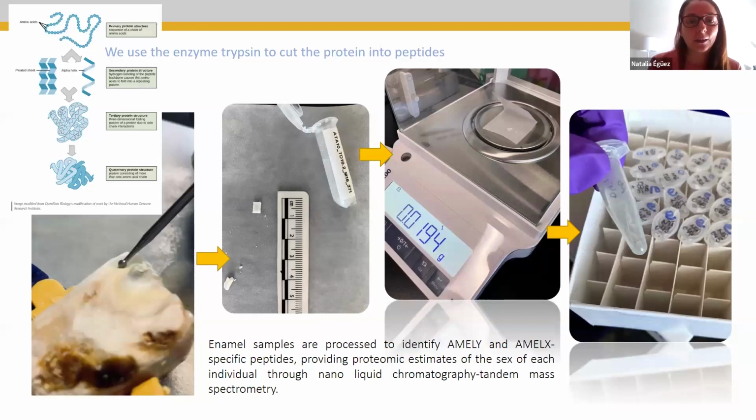So what we usually do is very straightforward. We have the protein when we get it from the sample in this way. So we need to deconvolute that, open it, because what we need is the amino acid chain. So we need to use enzymes like trypsin to cut the protein into peptides. So we know all these letters that appear there that I showed you before. We know this chain, and then we can track the changes.